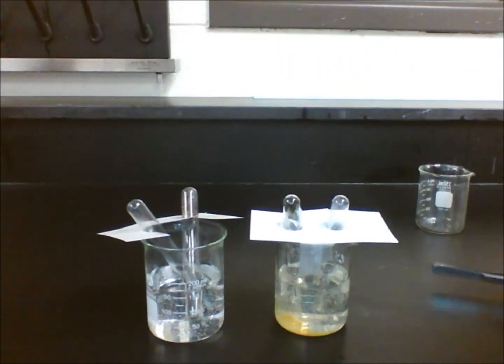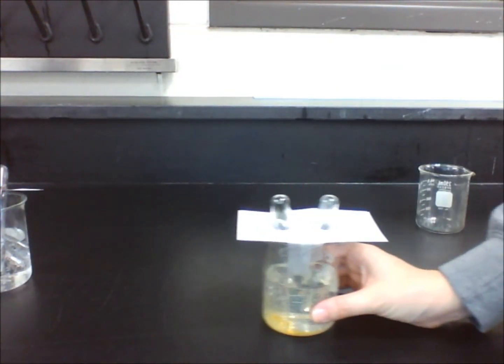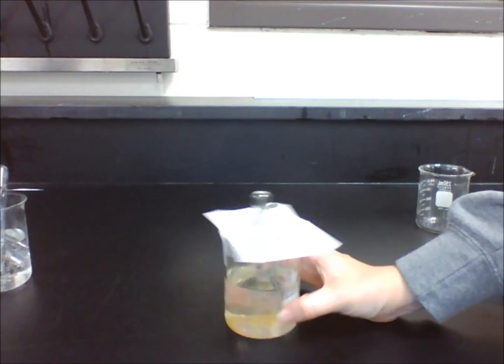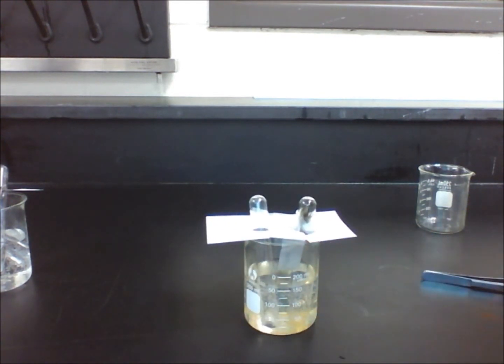Steel wool is made of iron and carbon, but for the purpose of this experiment, we are going to treat it as if it's made of pure iron. It has been dipped in vinegar to remove any dirt and protective coating for the experiment.